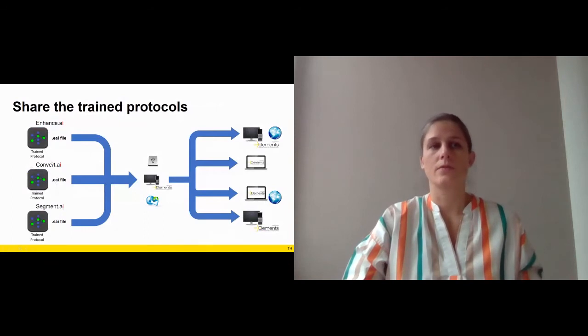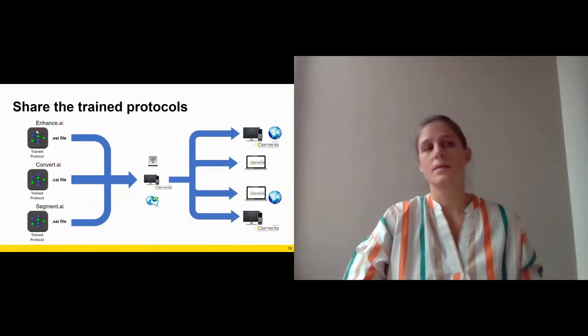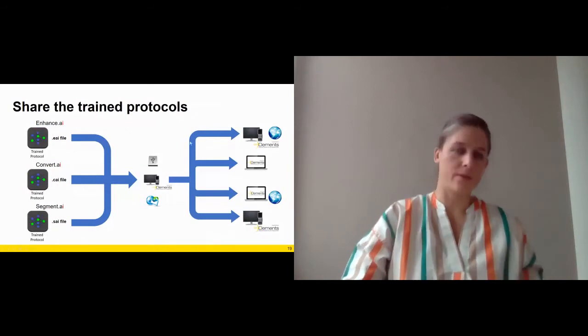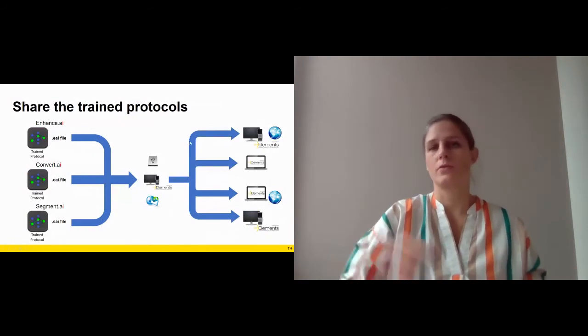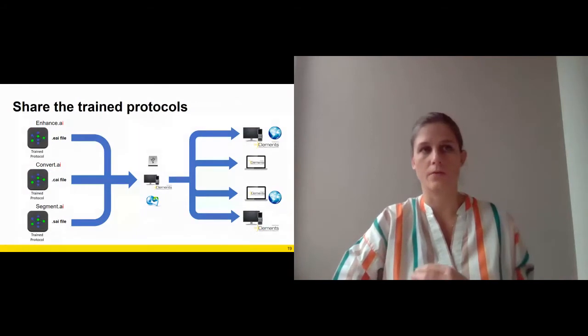And then this network file can be shared really, really easily. They all give you a different type of file, the train protocols, but these are rather small and easy to share files, which you can then transfer to several stations or to colleagues or whatever you can think of.